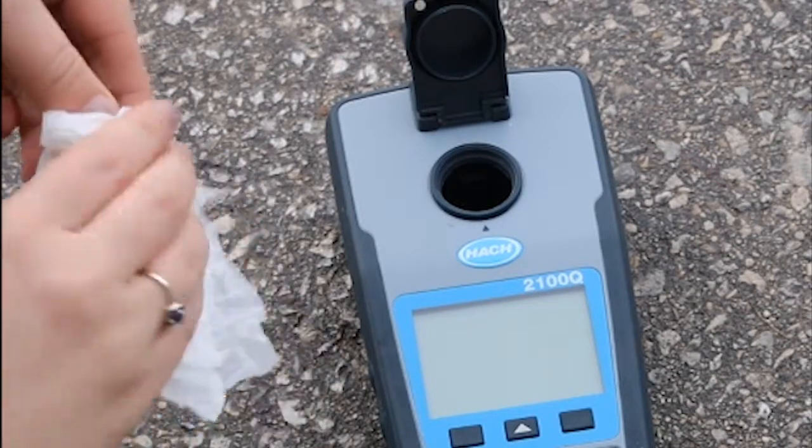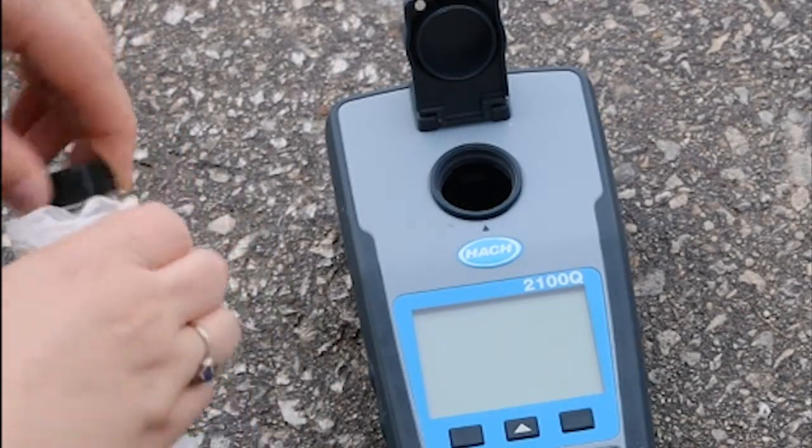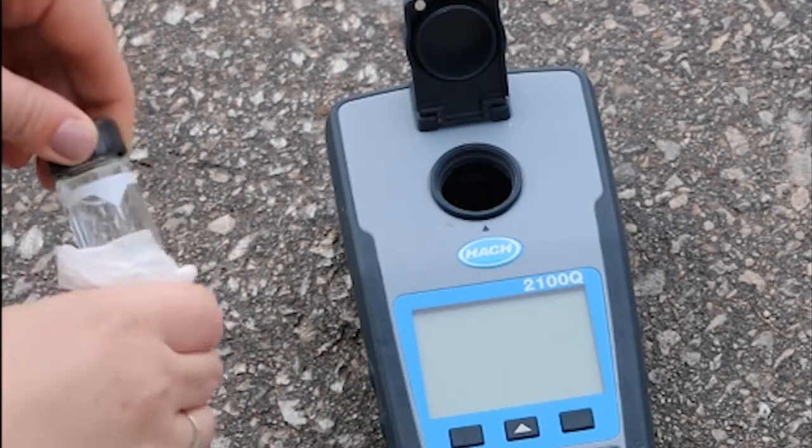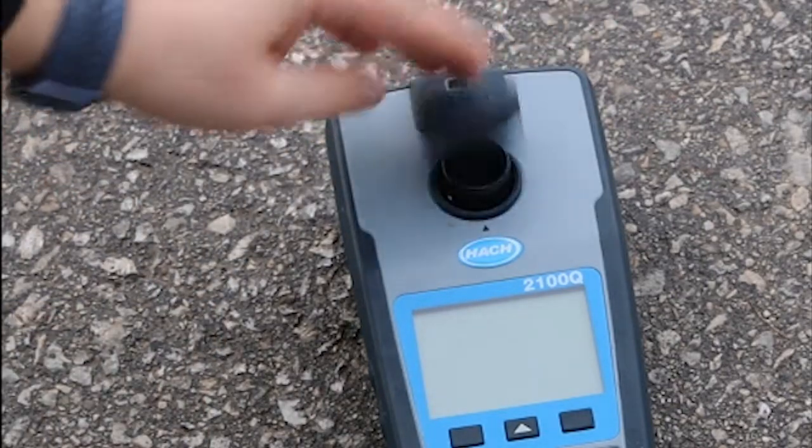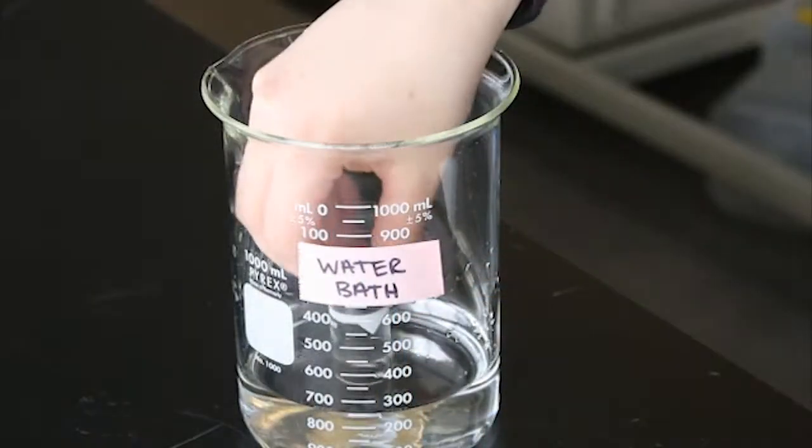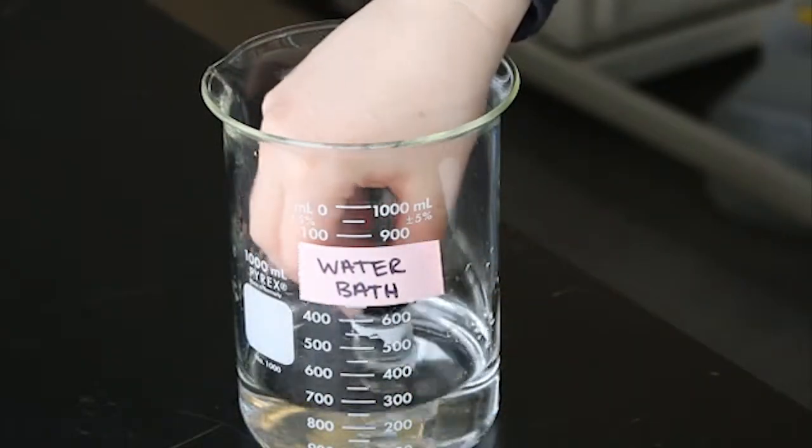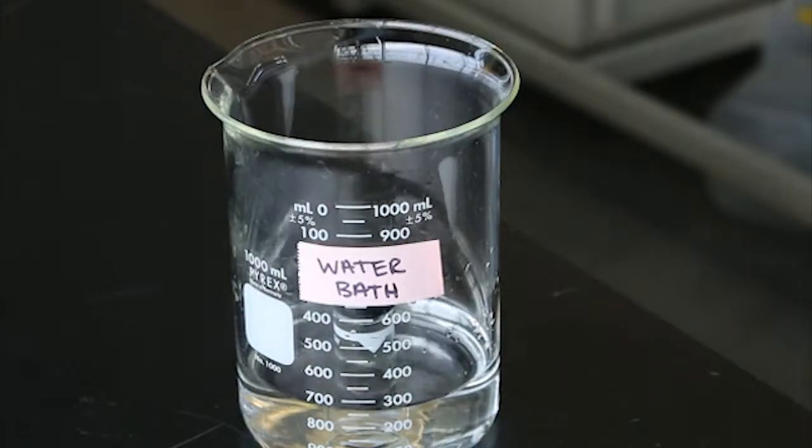Condensation may occur on a cell when a cold sample is being measured in a warm environment. This interferes with the turbidity measurement. If fogging occurs, you can let the sample warm slightly by letting it stand at room temperature or by using a warm water bath.